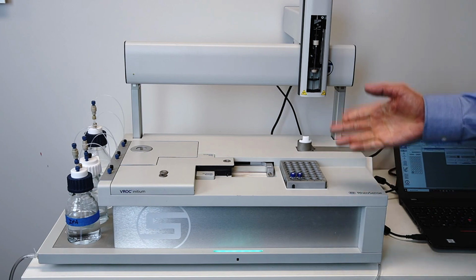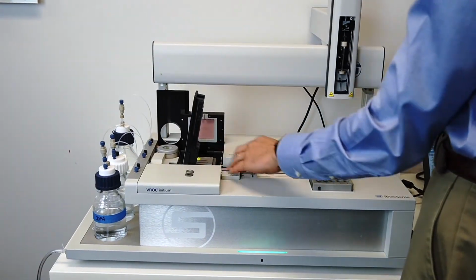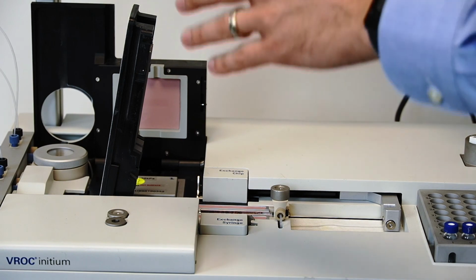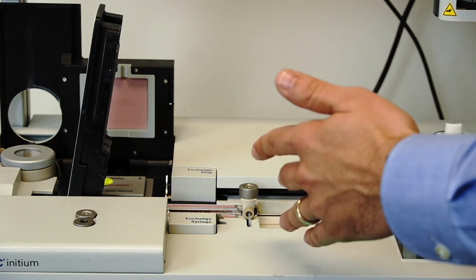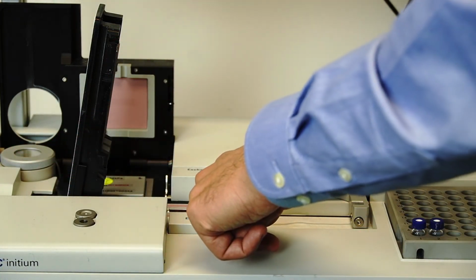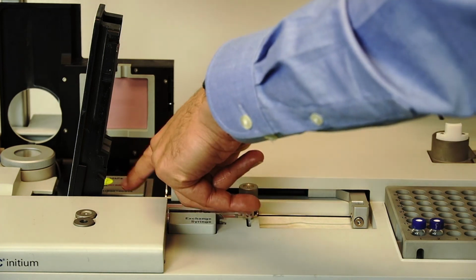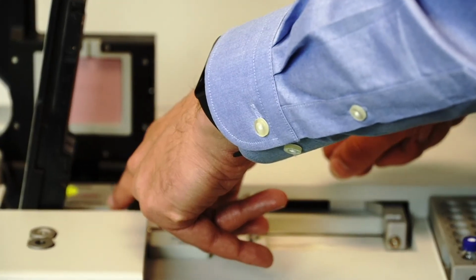So it's passed, and it's now going to test to see if there are any leaks here in the syringe area of the instrument. And now this is really important because a key feature of the VROC initium is sample retrieval. So if you load your sample with, say, 50 microliters of your precious protein sample, and you begin running your experiment, and it requires more than 50 microliters of sample to be able to measure the range of shear rates you're looking at, what the initium does is it pressurizes the air into the chip, and the pusher block and syringe will then draw back about 45 microliters of your sample.